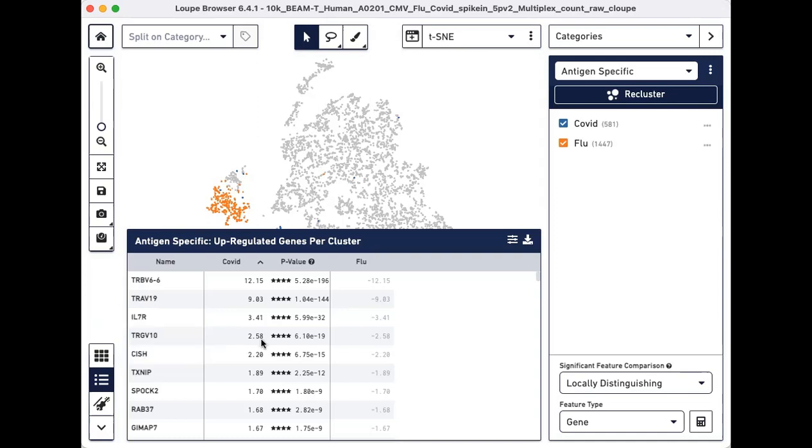As you can see, Loop Browser makes it easy to perform differential gene expression analysis on antigen reactive groups. We can quickly identify genes that are both interesting and biologically relevant without the use of command line interface.